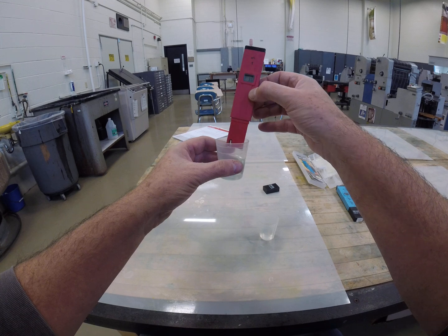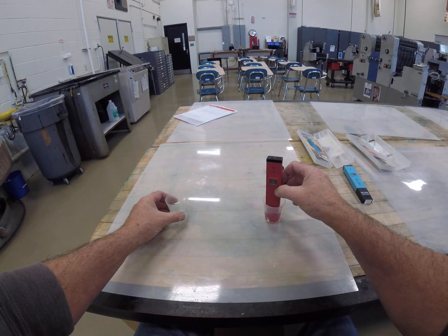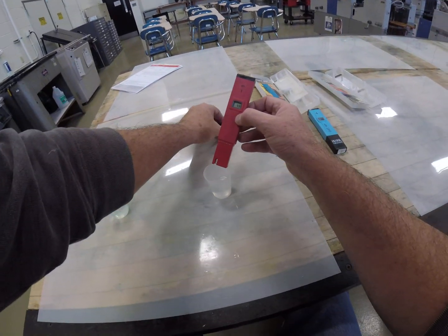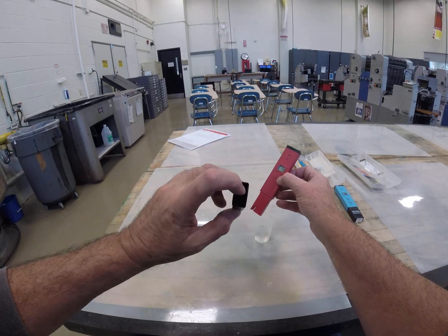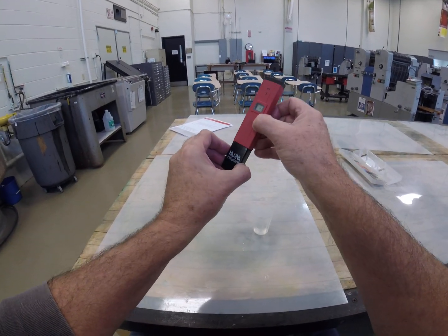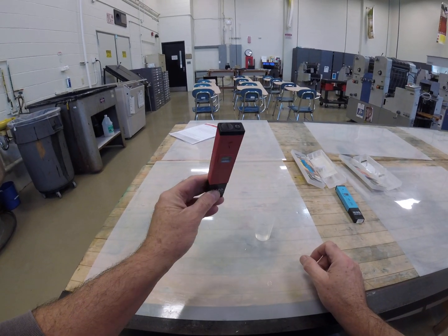It's important that when you do this you clean the probes so you don't get contamination and get a false reading. There's a little piece of felt in there — you really want to keep these probes wet; they should not dry out. Like any electronics, make sure you turn it off so you don't drain the batteries.